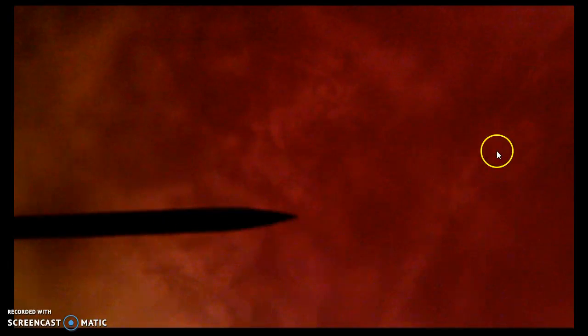Okay, now taking it over to the 400 power lens. I'm using that fine adjustment knob. Try to get a little bit more focus. It's about all we're going to get. Okay, you can see that there's a little bit of light right here still. So this is all dark. And this is all the E over here. Okay, sketch what you're seeing in that third circle.